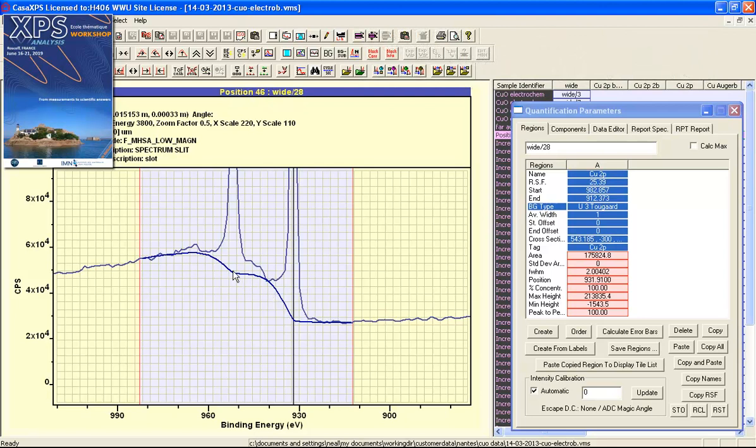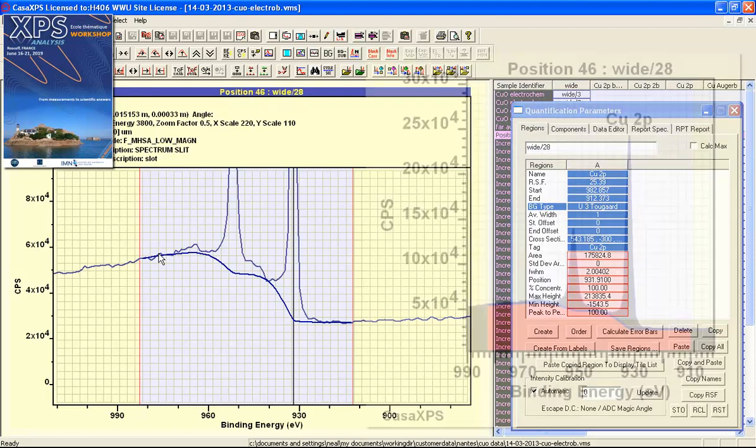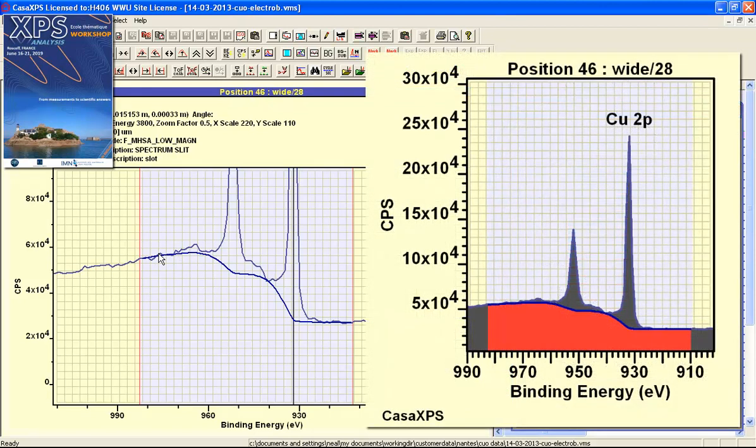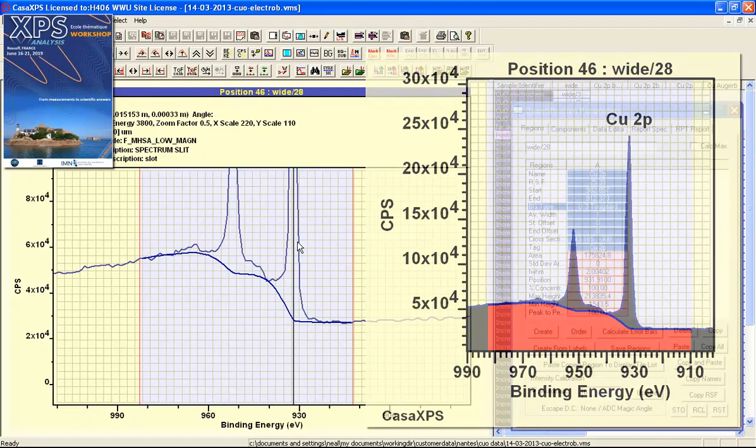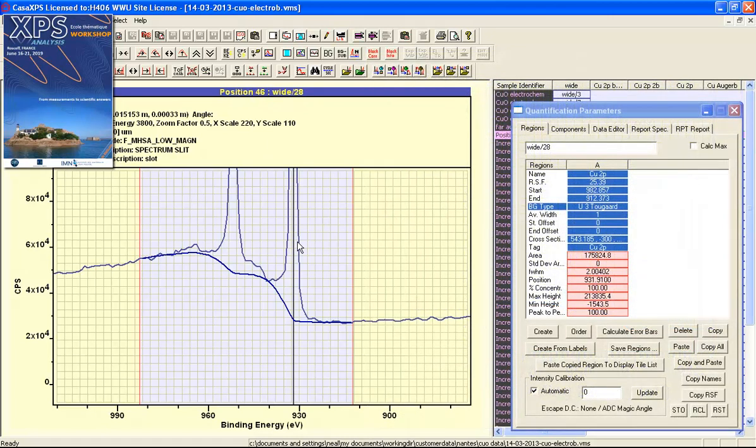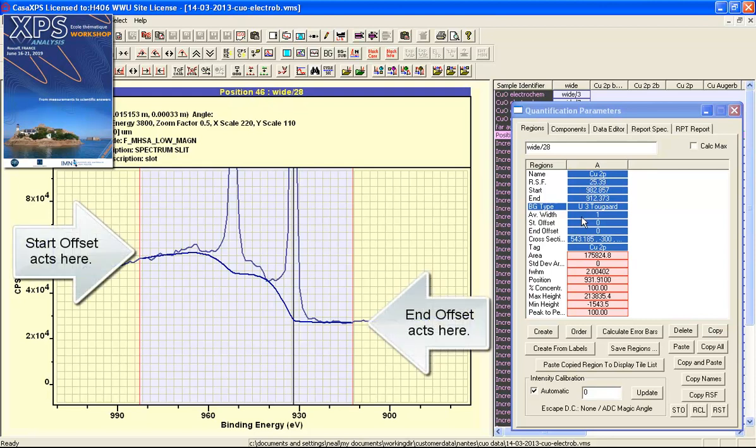The function of the background is to remove a contribution that corresponds to the inelastic scattered electrons so that we can quantify the signal above this background using the relative sensitivity factor and other corrections that we need to apply in order to produce a quantification.